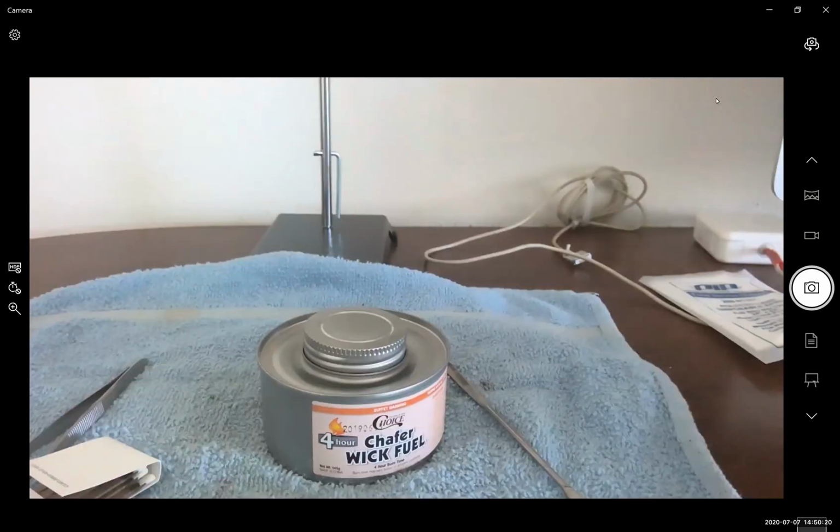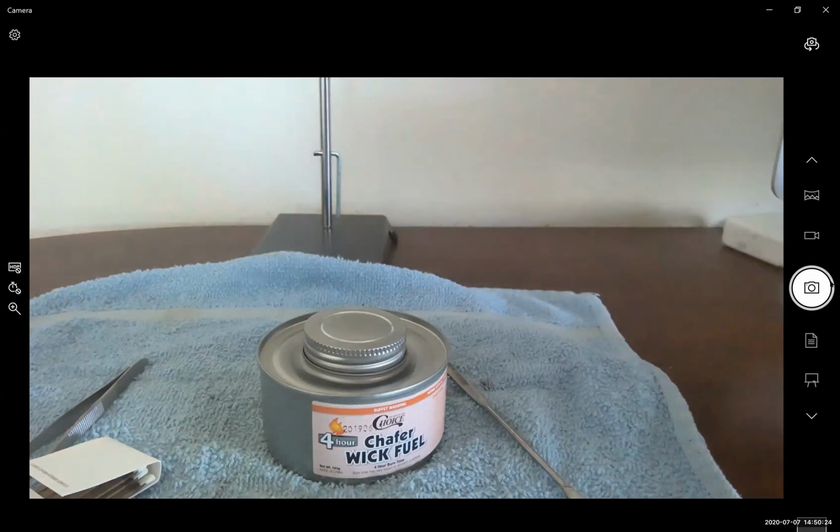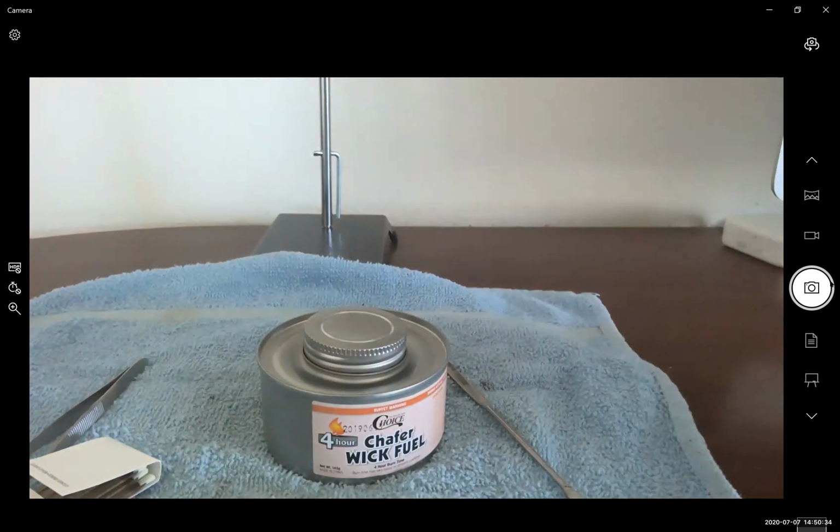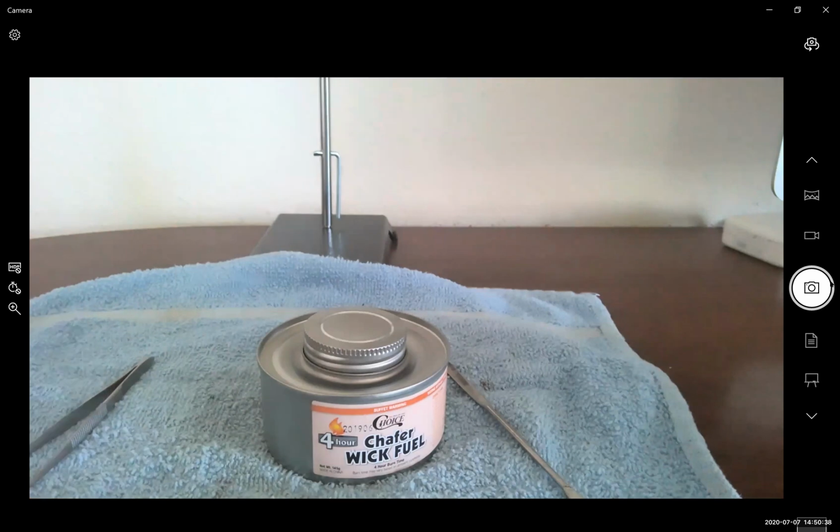Okay, so in today's experiment, we're going to be doing the electron configuration laboratory. Before everything begins, make sure you put on your portable laboratory coat and your goggles. I've taken the liberty of preparing all of the equipment that we are going to use today.